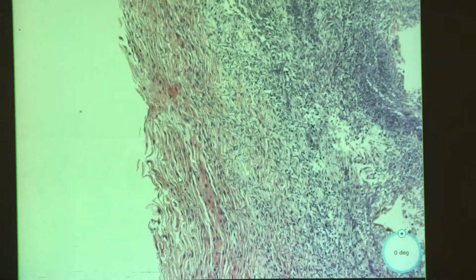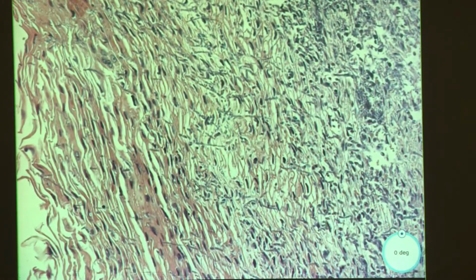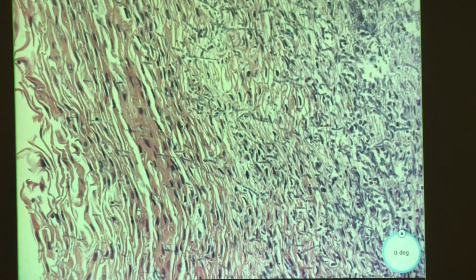Go back to that first piece, yeah, that one. And then take a look at the way the epithelial cells are streaming, and then what's going perpendicular to them. That might be the easiest way to see it. And it won't be easy to see at low power. Okay. Do you see them now? Like these things? Yeah.